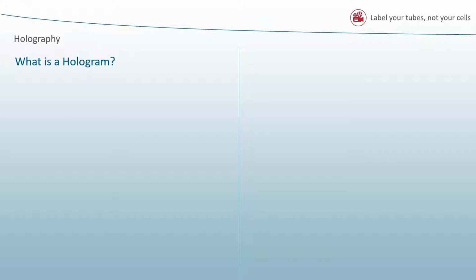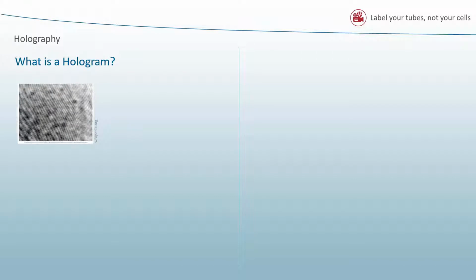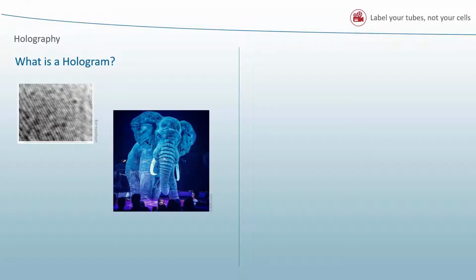Depending on whom you ask, it's actually not a picture. It is, which sounds maybe a little bit odd, a photographic recording of a light field. So have a look at this little bit grisly image here. That's a pattern on a photo paper that, if you shine the right kind of light on it, will reflect the light rays so they bounce back and form an image. They will form a hologram. A holographic image can then be viewed from different angles as if the object is really there. It's like 3D. You can see the objects without the help of any special glasses or other optics.